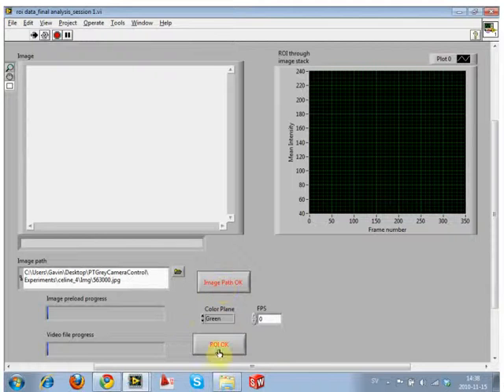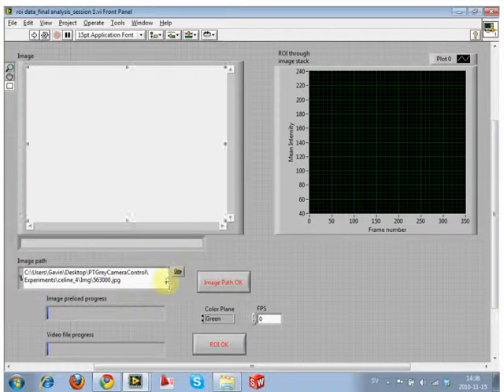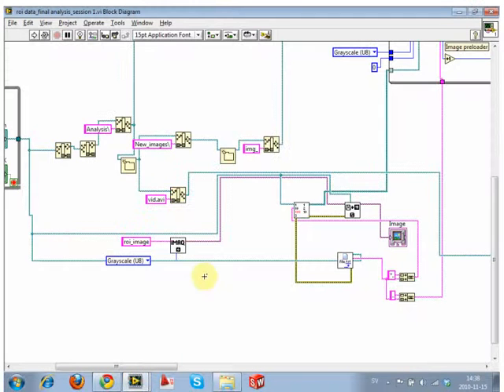Let me show you this. What's happening is the extension. This is reading this file. We give it a file, and it tells us what that file name is. Let's just assume it's this, let's call it file.txt. Then what it's doing is looking for where this dot is. In this top line, it's telling you what's after the dot, and in this bottom line, it's telling you what's before the dot.